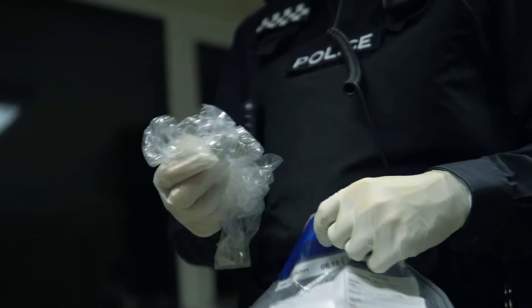Hi, I'm Chris Lankford, Product Manager at Regaku. I'm excited to show you our Progeny Rescue Flex product. Progeny Rescue Flex is our advanced narcotics analyzer designed for use by law enforcement.